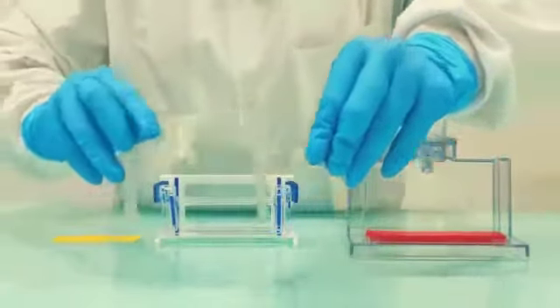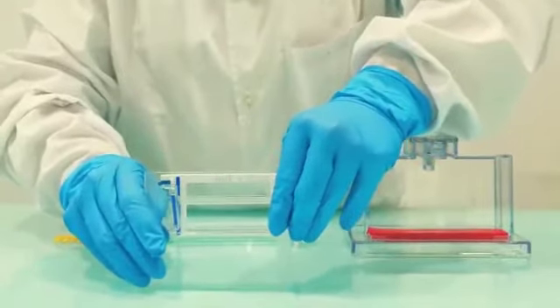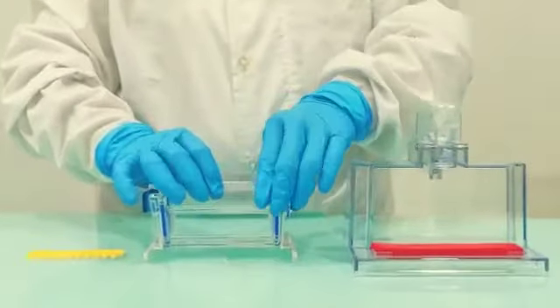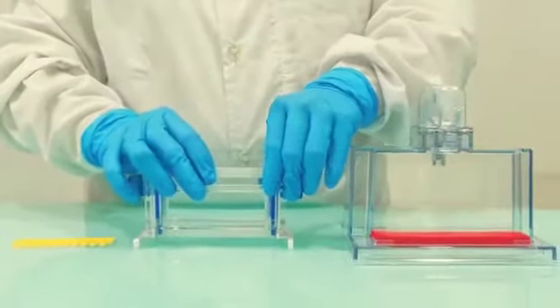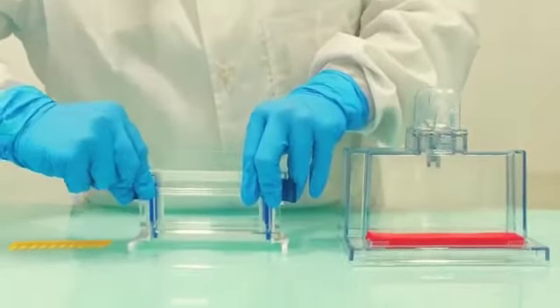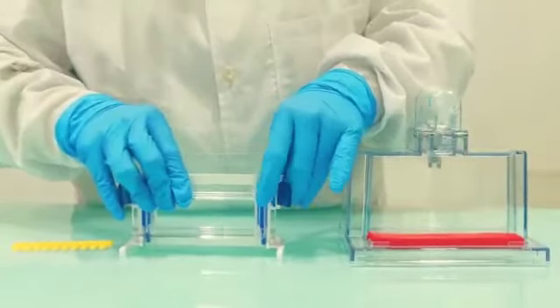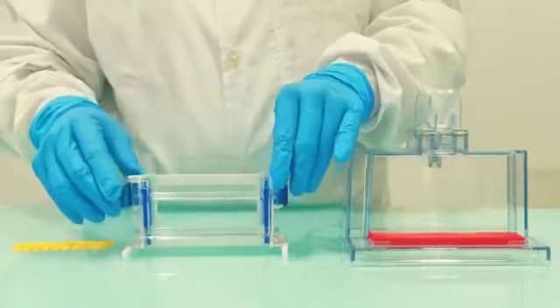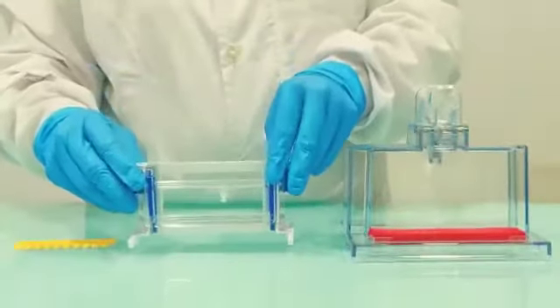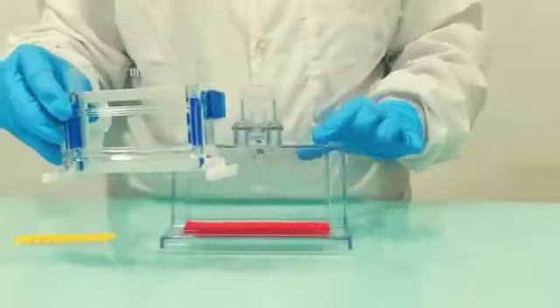Now put the short plate in front of the spacer plate like this and clamp it to the casting frame carefully. Ensure that the bottom is flat.